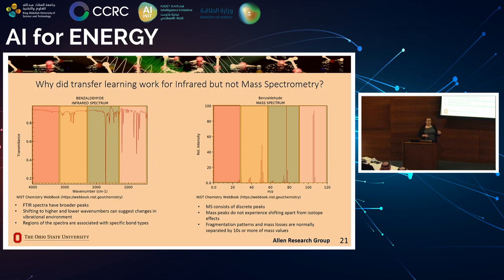What we're able to determine is that when we look at IR data, we're looking at vibrations. We're looking at how that molecule is responding within space and how it responds to that light in response of its bond vibrations. Now, these bond vibrations are really sensitive to environment. If you have other species in solution, or if you have a different phase, these peaks can actually shift both left and right up to tens of wave numbers. And during this process of the convolutional neural network, we think that through those convolutions, it makes it less sensitive to these peaks shifting, due to the fact that even if they're shifting tens of wave numbers, these peaks tend to generate in the same areas, or at least regions of the spectra.